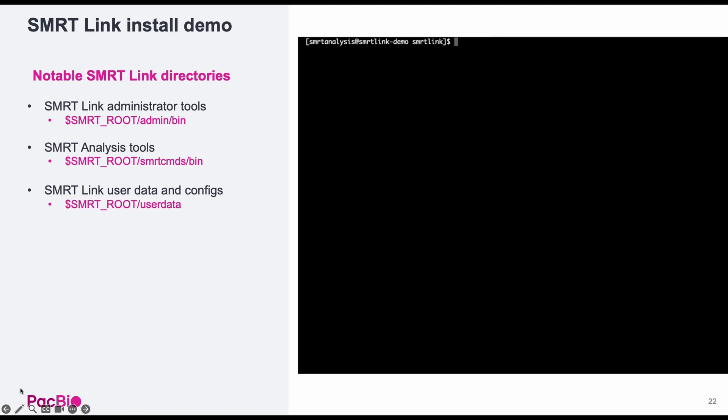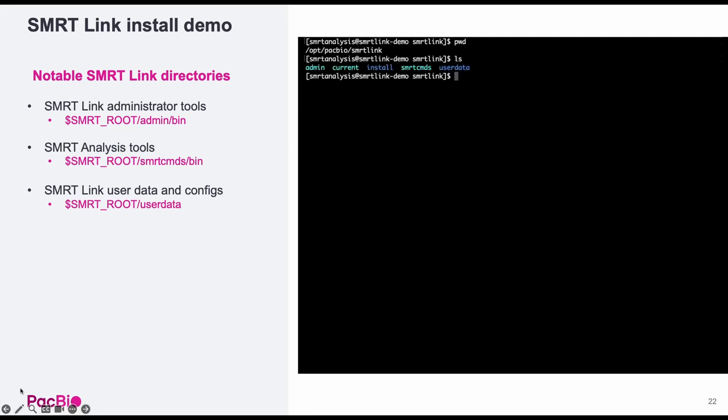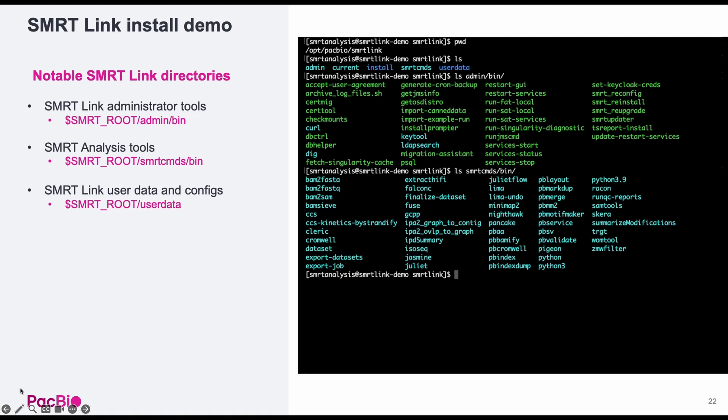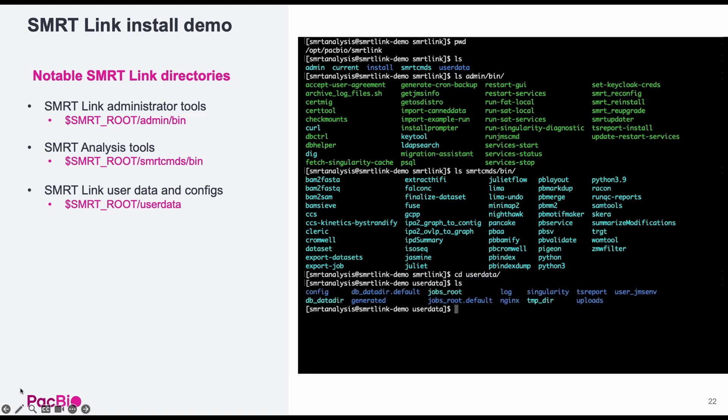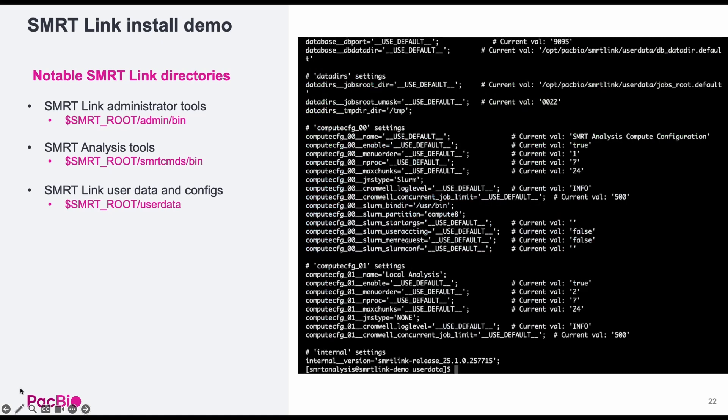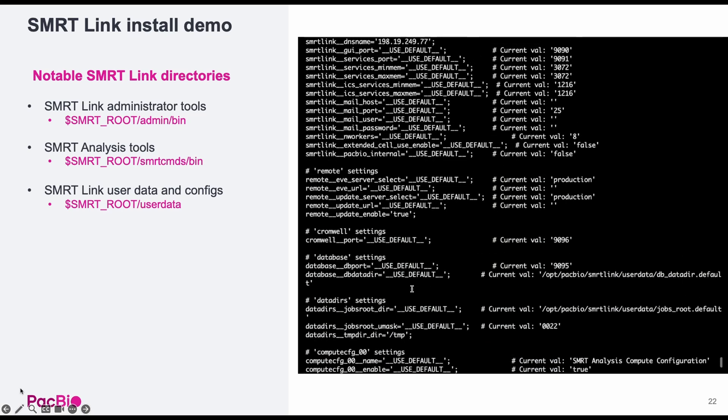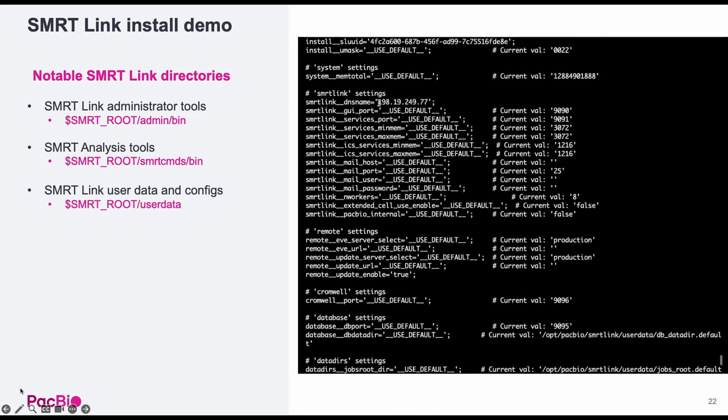Navigating to SmartRoot, you'll find several directories. Most importantly is the admin bin directory, which includes the SmartLink admin tools such as services start and stop. The smart commands bin directory, which contains PacBio bioinformatic tools such as PBSV. And the user data directory, which contains the SmartLink database and job directory set up during install, as well as the SmartLink configuration file, which can be used to easily track down your settings and your IP or DNS name if needed.